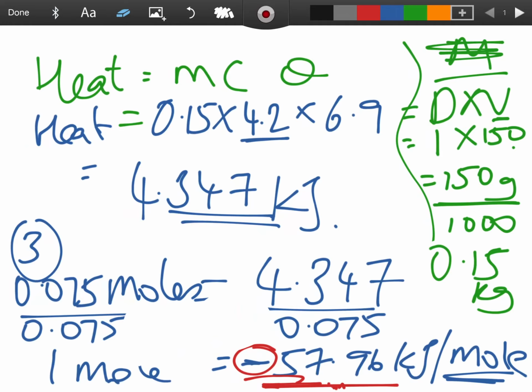Finally then, for part F, it asks you to identify the hazard associated with use of these solutions. Well, that would be your corrosive symbols. Will you familiarise yourself with your safety symbols? In the front copy of your book there, inside the front cover, the safety symbols are there. So the corrosive one is where you have the 2 test tubes dripping liquid out of them. Do you remember? One is burning a table, the other is burning your hand. So they asked you to draw that there.